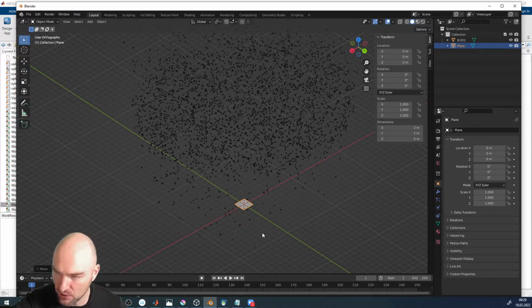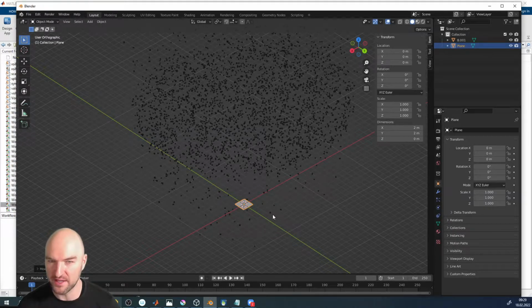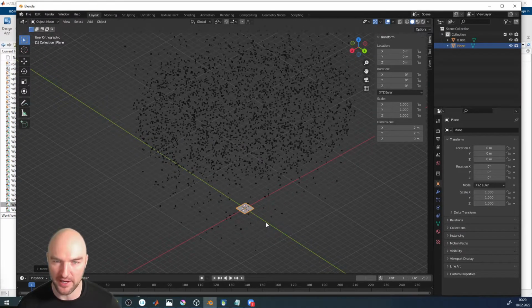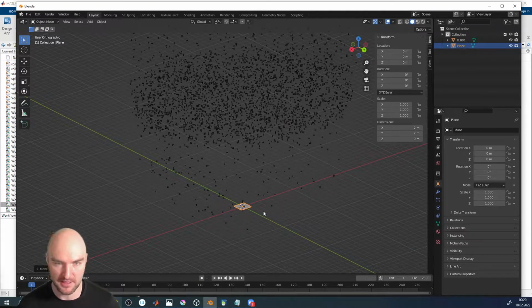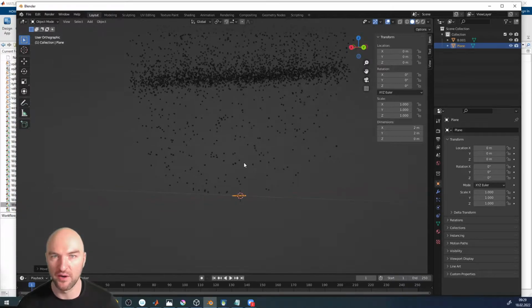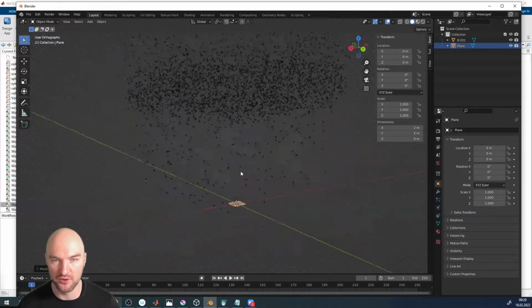But if you export objects to other software, and re-import and so on and so forth, then that's not always guaranteed. So I think it's good practice to keep the object origin at the world origin, but it's not 100% necessary. Yeah. So okay, so let's then go and move our grain boundary onto the object.